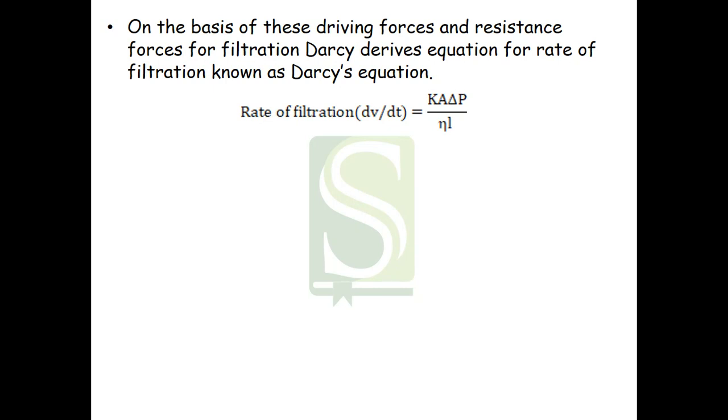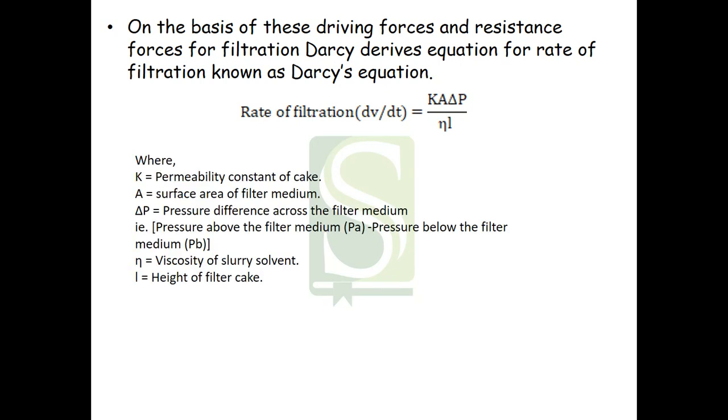The rate of filtration dV by dt is equal to K into A into delta P divided by eta into L. Here K is the permeability constant of the cake, A is the surface area of the filter medium, and delta P is the pressure difference across the filter medium, that is, pressure above and below the filter medium. Eta is the viscosity of the slurry solvent, and L is the height of the filter cake.